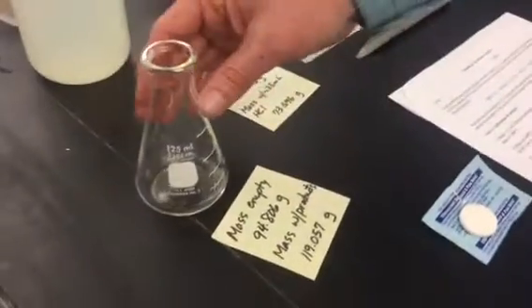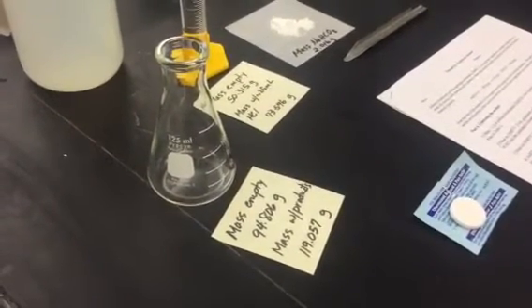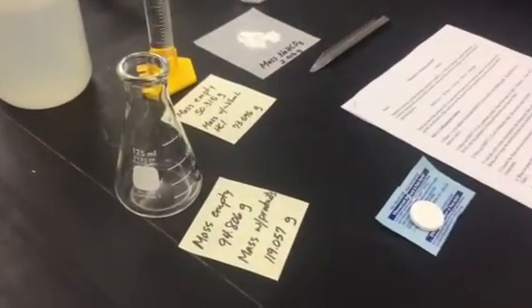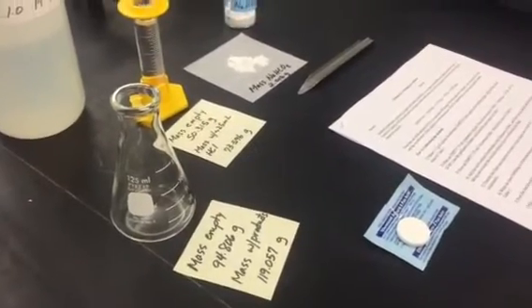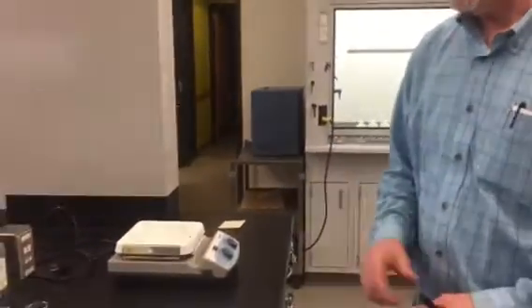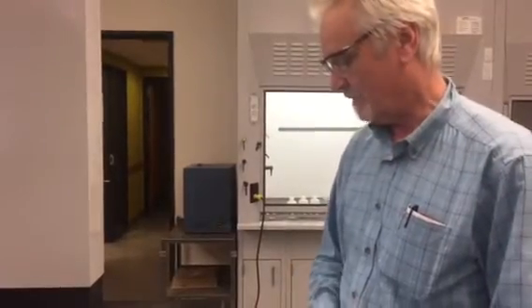You're also going to mass an empty 125 milliliter Erlenmeyer flask, and it's going to contain all of our reaction products when we're done, and so when the reaction is finished, we're going to mass it again to have a mass of all of the products, and then we're going to subtract all of the numbers appropriately in order to figure out the amount of carbon dioxide that was produced, and as a result, the moles of sodium hydrogen carbonate that we started with. Once we calibrate the procedure, we're going to do it again using a commercial antacid tablet that contains sodium bicarbonate, and when we study the reaction the second time, we can figure out whether or not the advertised amount is the same as the amount on the label.